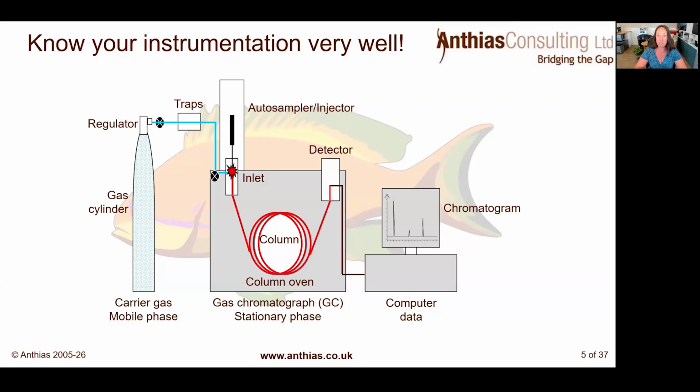So knowing the instrumentation, knowing how each part of it works, and what parts they play in the analysis of your sample is really, really important. And if there are any parts that you don't understand, then that's where you really want to go and get some training, because it's really going to help with your troubleshooting.